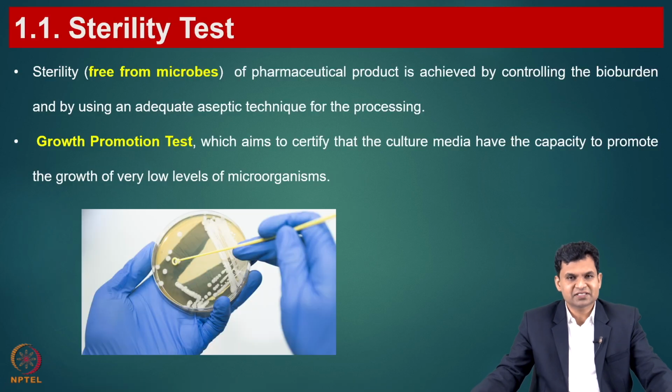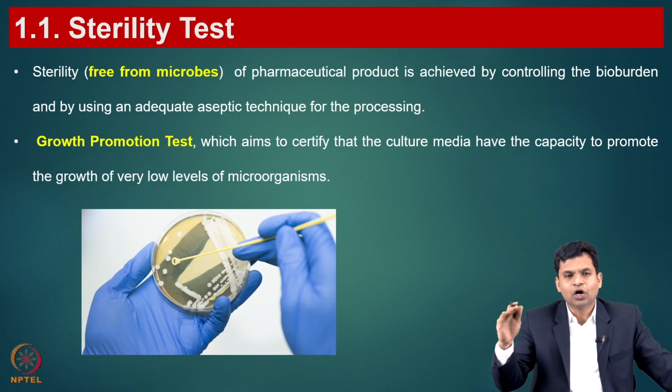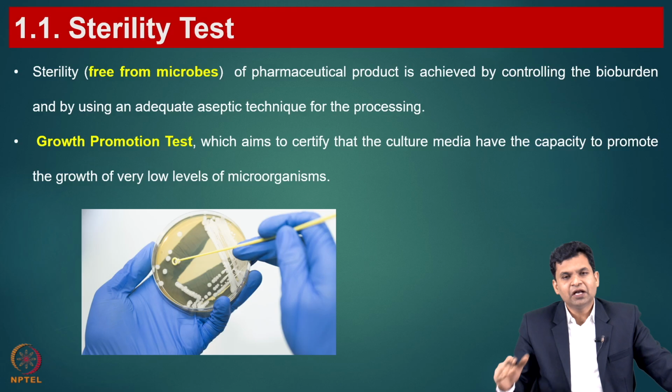The first test is the sterility test, and we know that sterility means free from all viable microorganisms. Now, how do we get sterility?